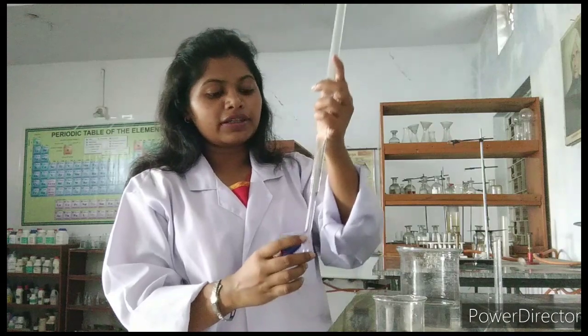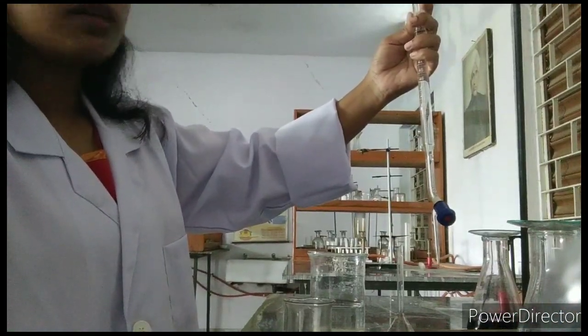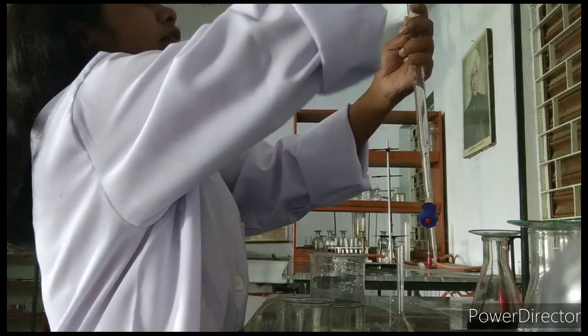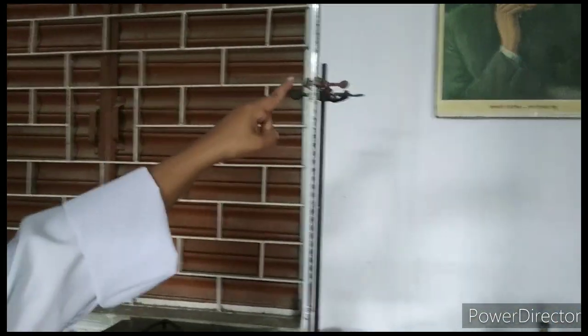Whenever we do the titration, we will keep the burette here in the clamp stand. You can see here — this is the clamp stand. With the clamp stand there is a knob as well, with which we tighten and keep the burette in place. Let me show you here — with this knob I am just tightening it, and now the burette is placed in the clamp stand.